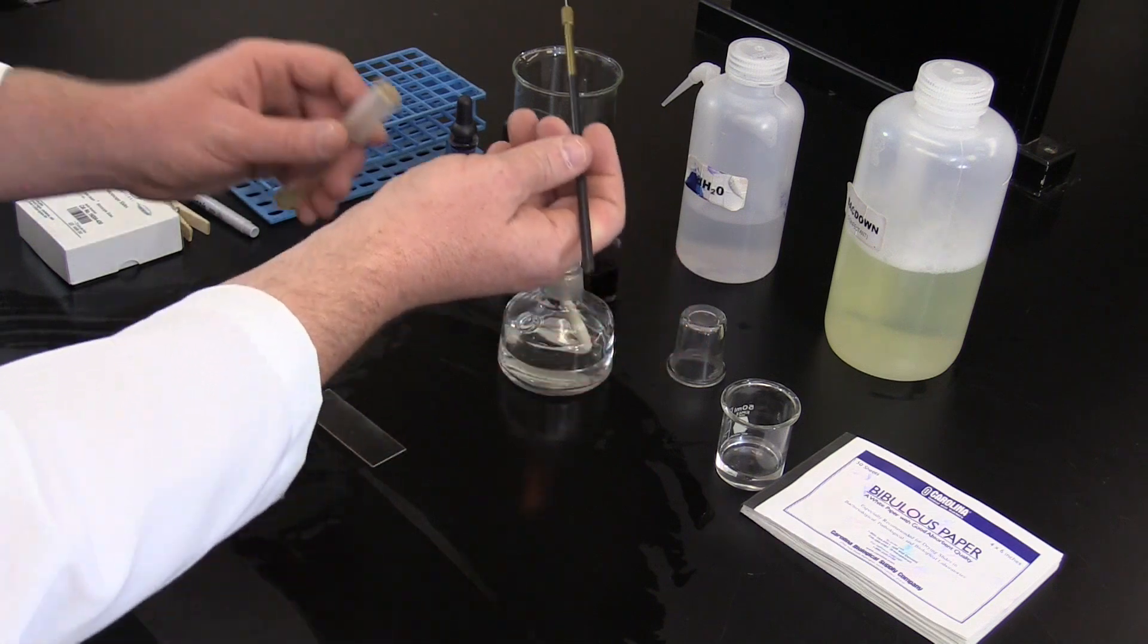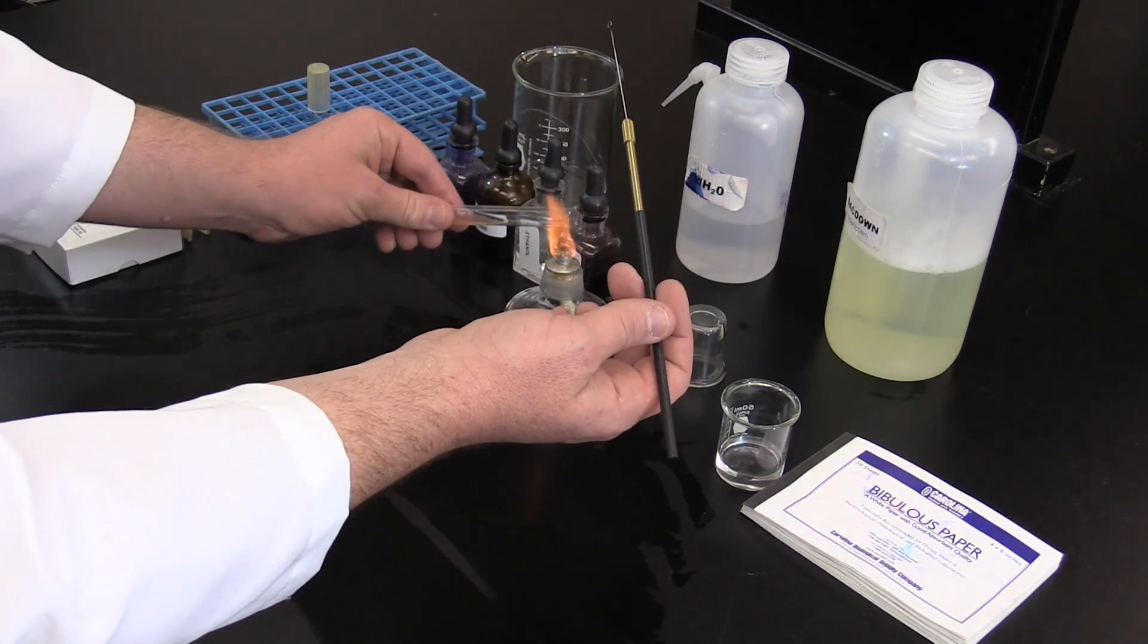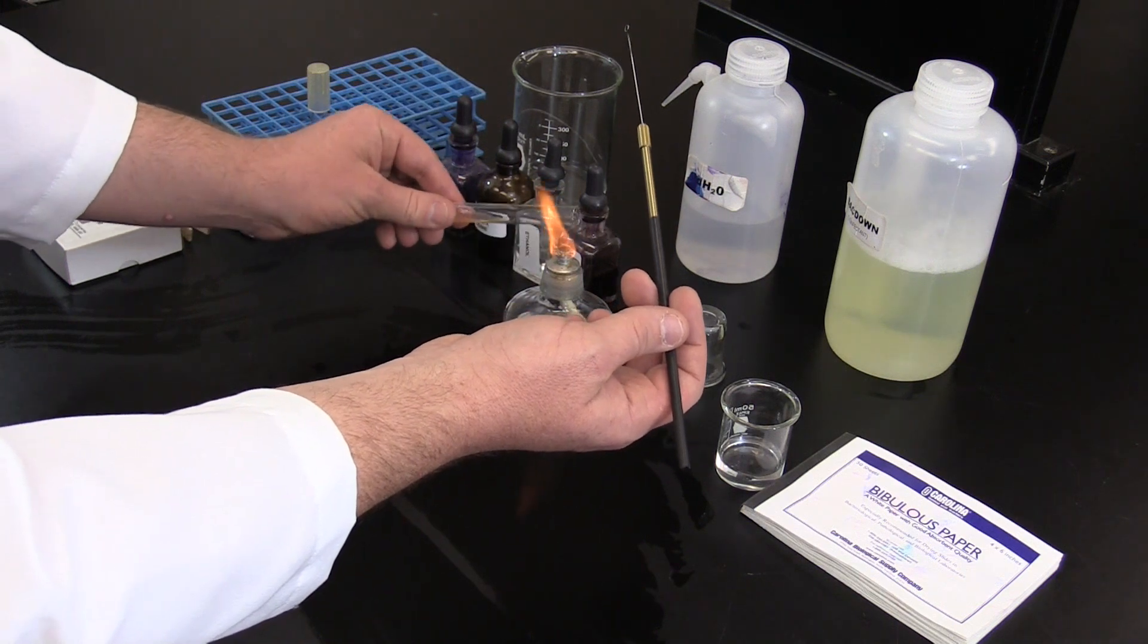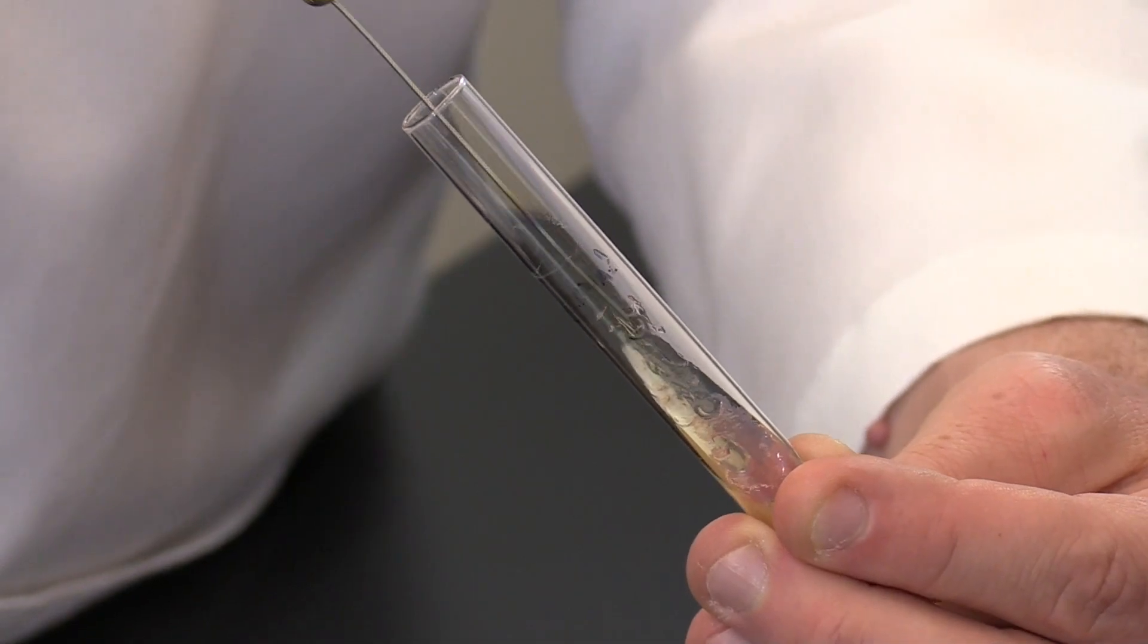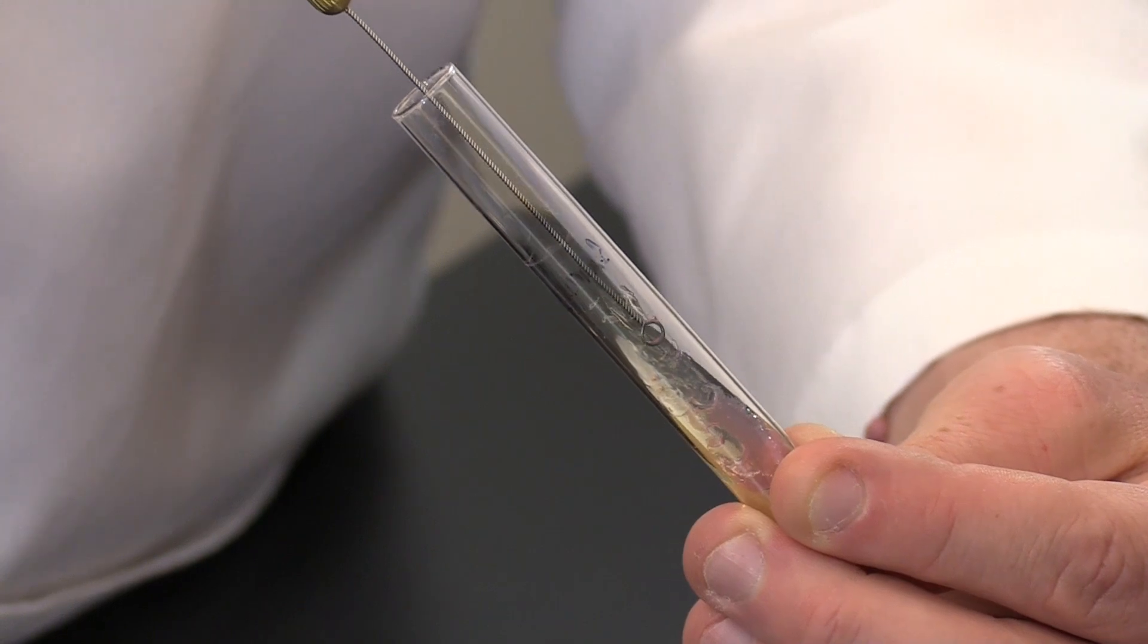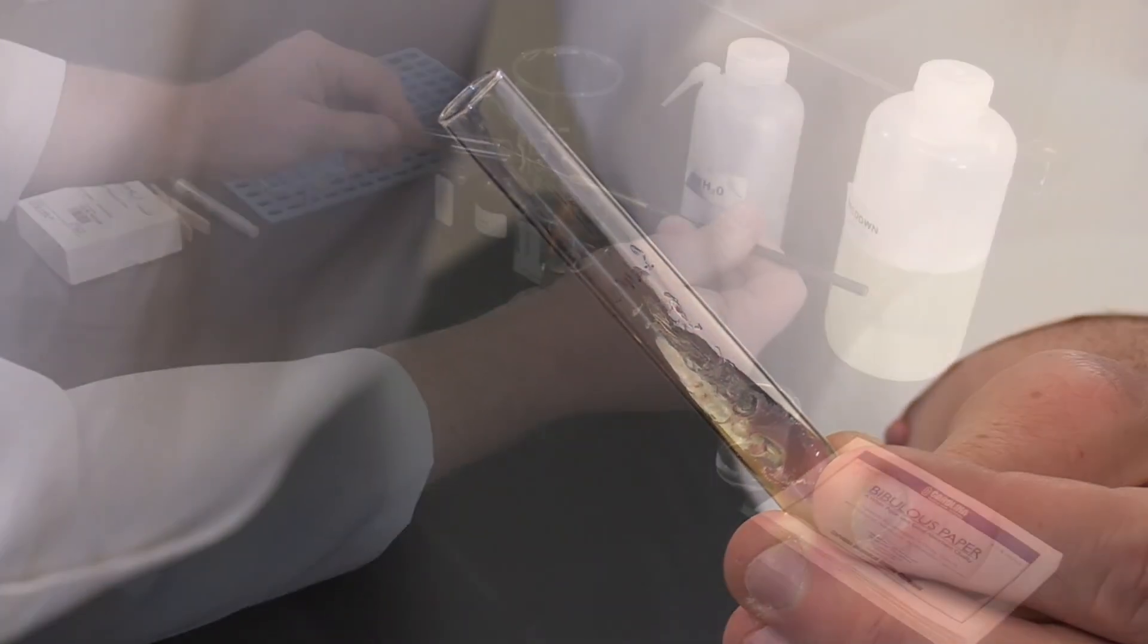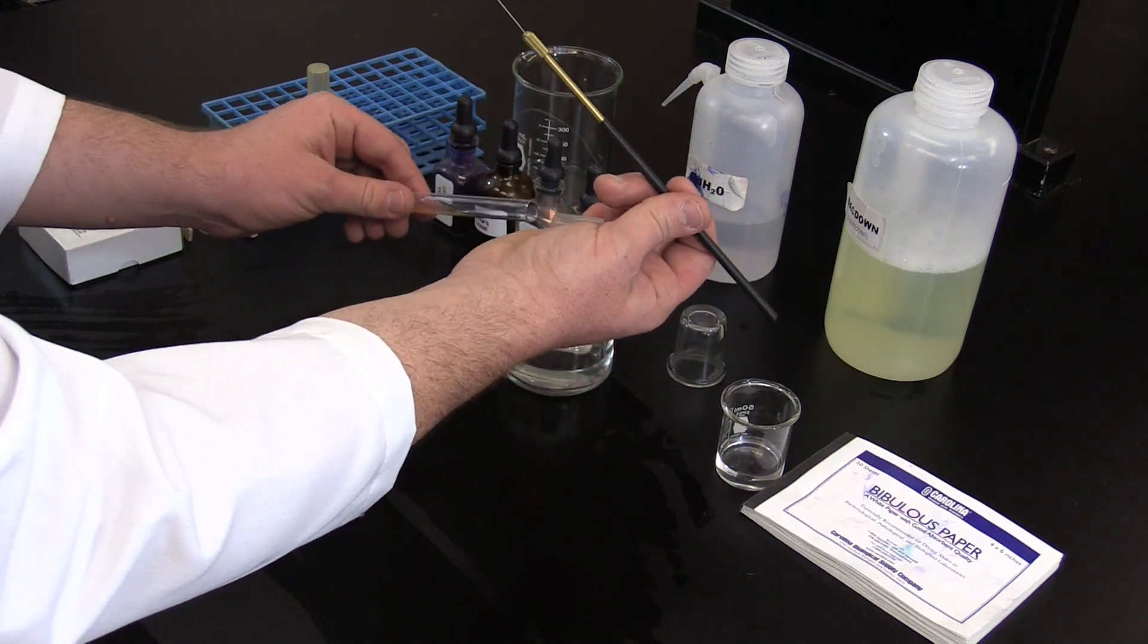Allow the loop to briefly cool. Pick up the glass tube, remove the lid and gently flame sterilize the opening. Insert the loop into the tube without touching the sides and gather a small amount of bacteria from the slant. After removing the loop, gently flame sterilize the opening of the glass tube and return the cap.